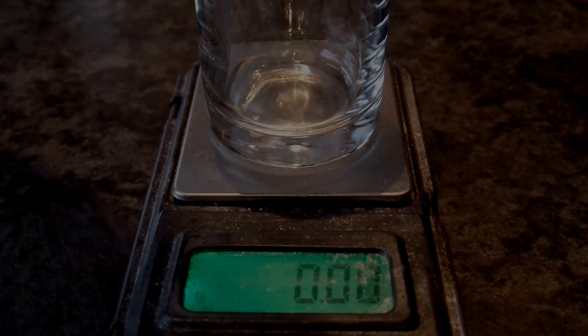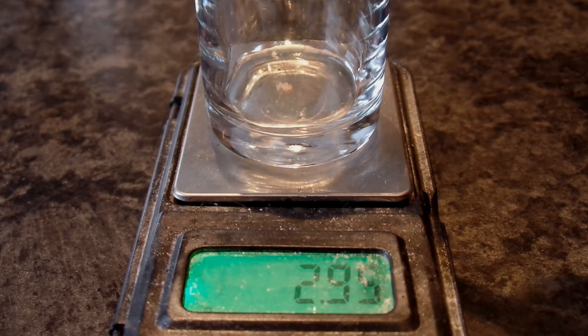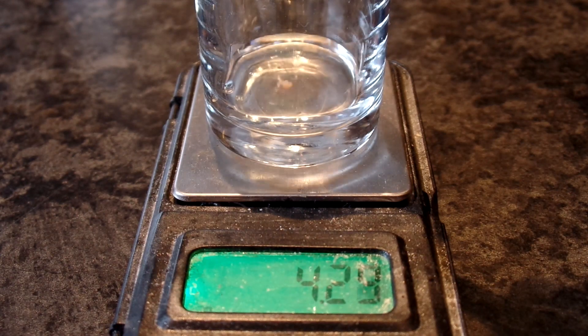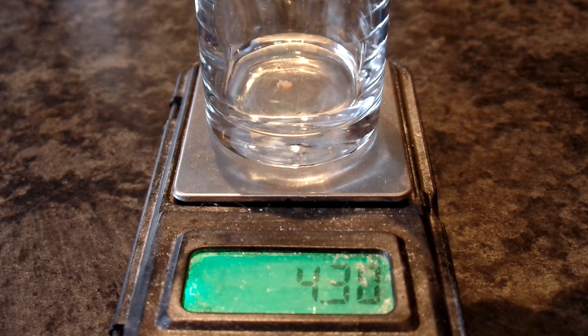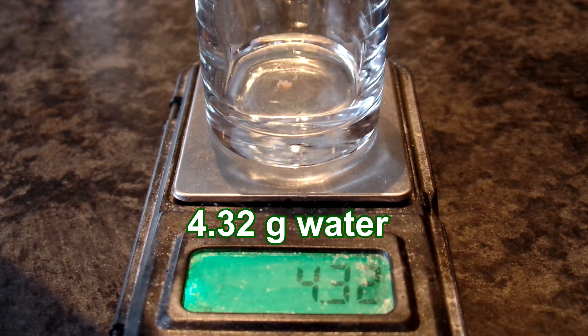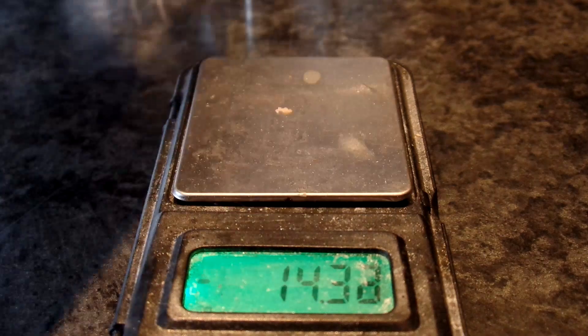For the second experiment I will use moles instead of grams. We will work on a 20 millimole scale. Theoretically I need 60 millimoles of water for every 20 millimoles of hydroxide for this reaction, but I will use 4 times as much water — so 4.32 grams.